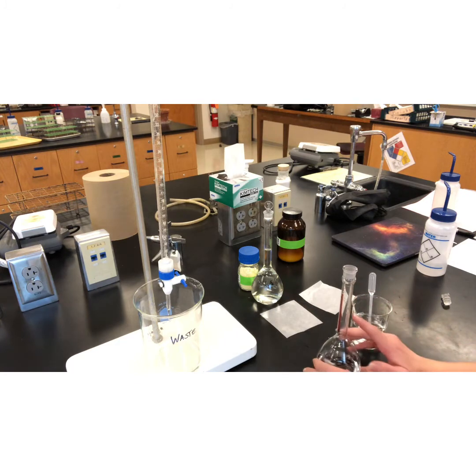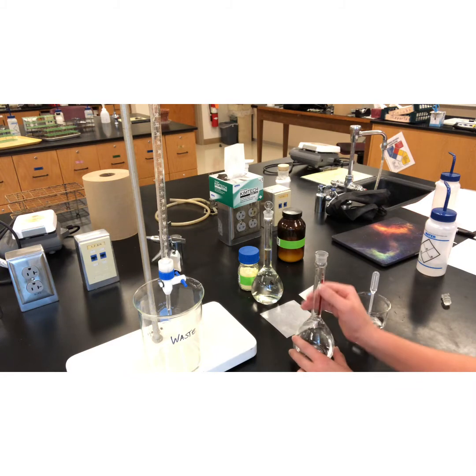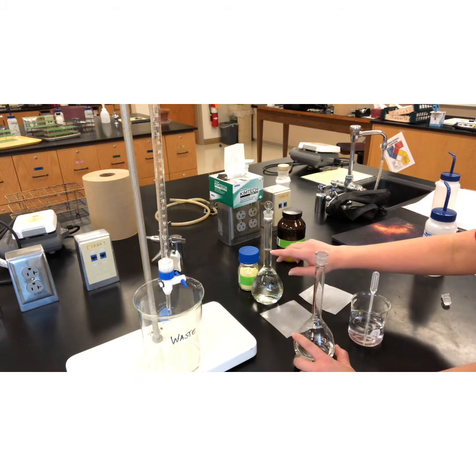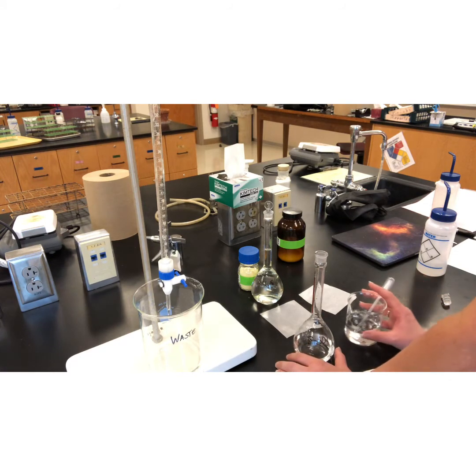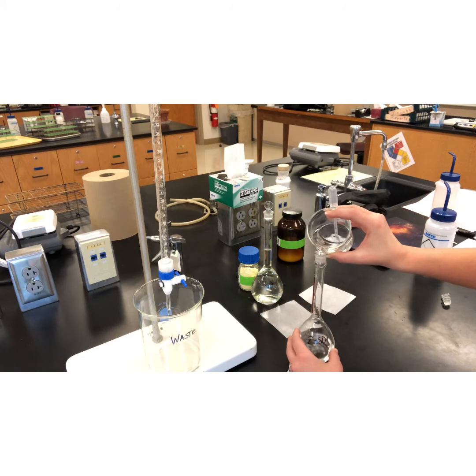So on this piece of glassware, we have this little guy that helps you see. This little red mark, it'll help you see your line. So on this piece of glassware, my line was all the way up here. So on this glassware, my line is all the way down here, and that's specific to each particular piece of glassware because they are calibrated to be exactly that volume. So always make sure you pay attention to where that line is and you don't overshoot it, because the struggle is real, my friends. The struggle is real when you have to start over.